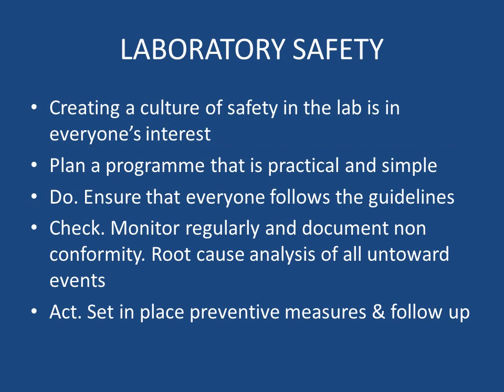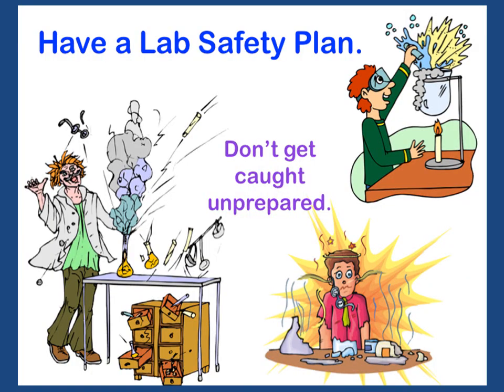So to summarize, creating a culture of safety in the laboratories is in everyone's interest. Plan a program that is practical and simple to ensure that everyone follows the guidelines. Check and monitor regularly and document non-conformity. Root cause analysis of all untoward events should be done, and set in place preventive measures and follow-up. Have a laboratory safety plan in place. Do not get caught unprepared.